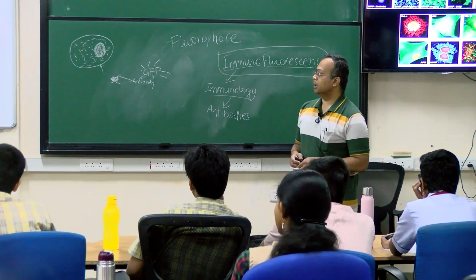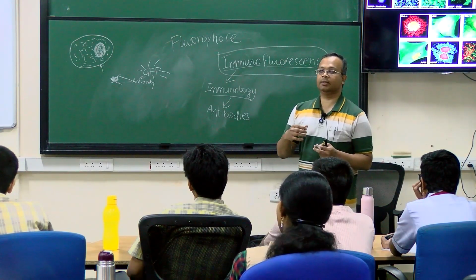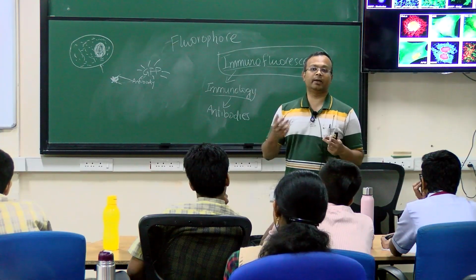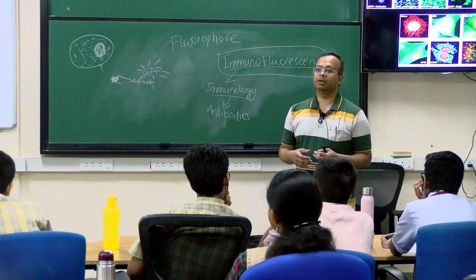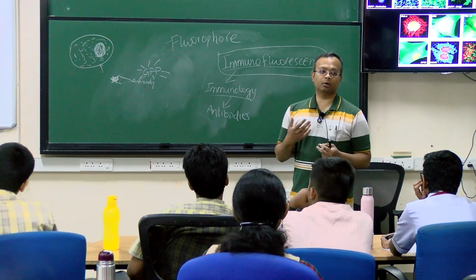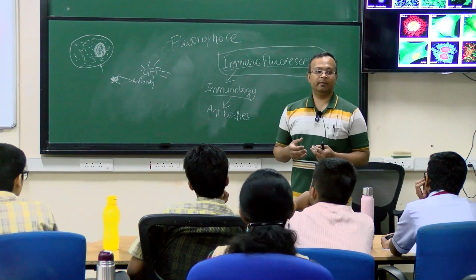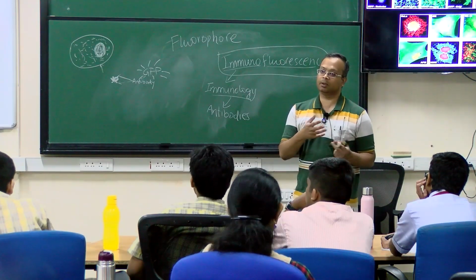Okay. And using this you can get different information, like which organelle is close to which organelle, interacts with which organelle. Is the mitochondria close to the nucleus or is the mitochondria far away? Okay. If the cell is having a lot of metabolism, its mitochondria will appear in one shape. If the cell is not having a lot of metabolism, its mitochondria will appear in another shape.